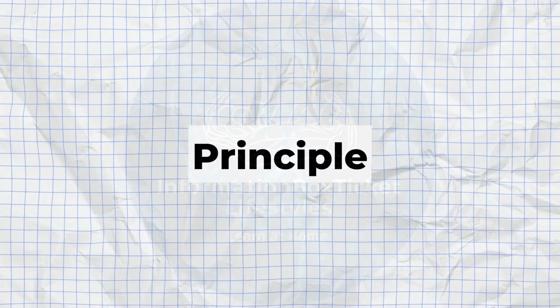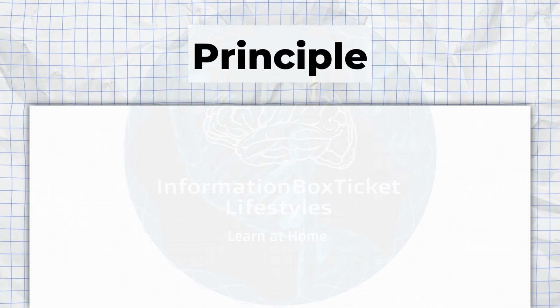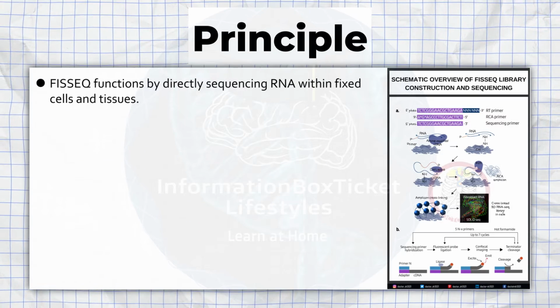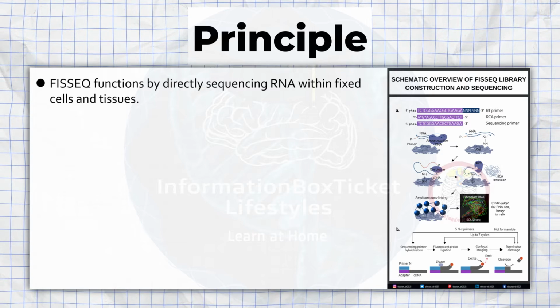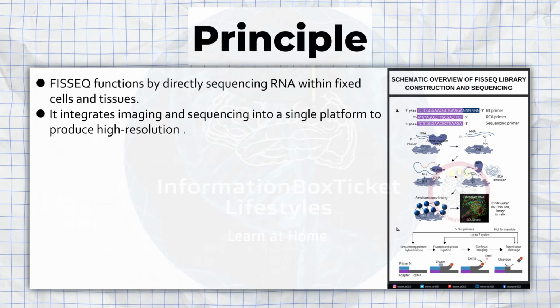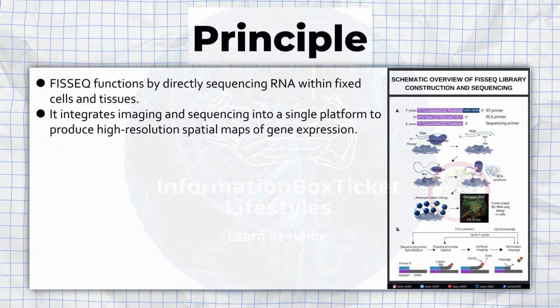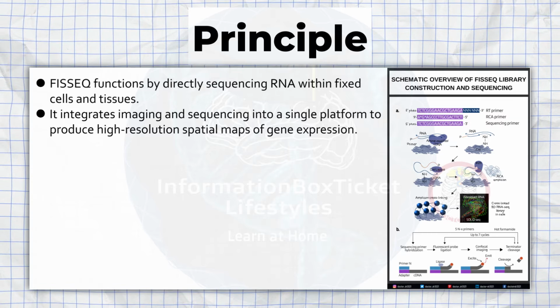Principle of Fluorescent in Situ Sequencing. Fluorescent in situ sequencing functions by directly sequencing RNA within fixed cells and tissues. It integrates imaging and sequencing into a single platform to produce high-resolution spatial maps of gene expression.